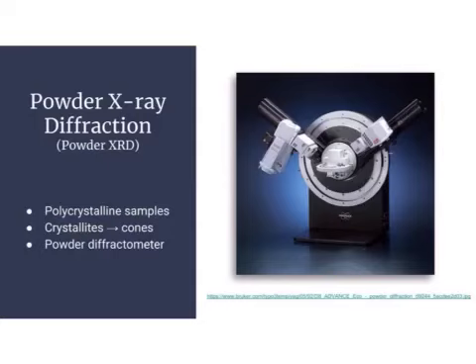The way we test these is by using a powder diffractometer, as we can see over on the right. Bruker Scientific is an organization that makes a lot of these, and how it works, in the way we've been looking, is that our component on the left emits our beam, which comes in and hits our sample plate, which is then reflected and picked up by our reader.